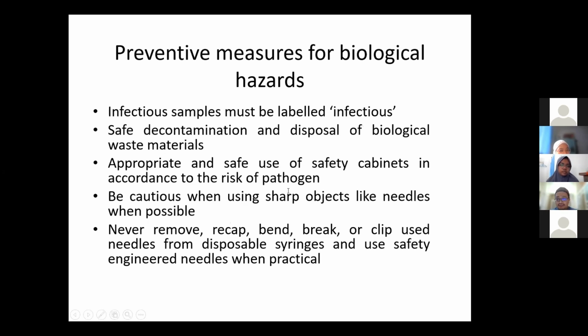Yeah, the other safety precautions with regards to the needles. Needles in the lab, or any sharp in the lab, should be pointing downwards instead of forward. Later, when we do the phlebotomy lab, we will look at the habits of every single one of you.